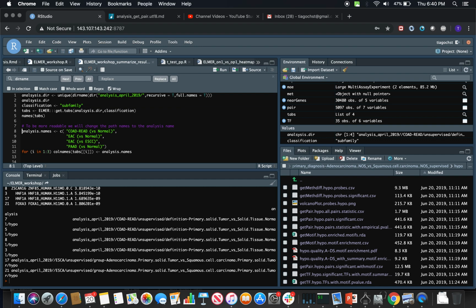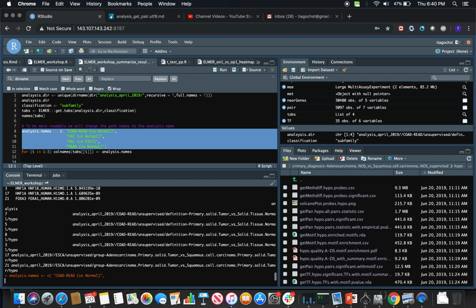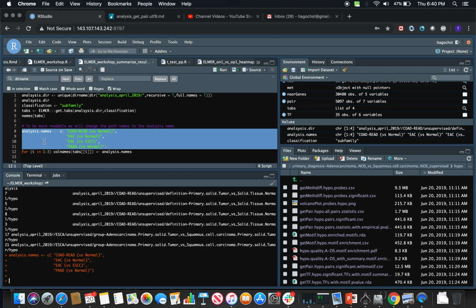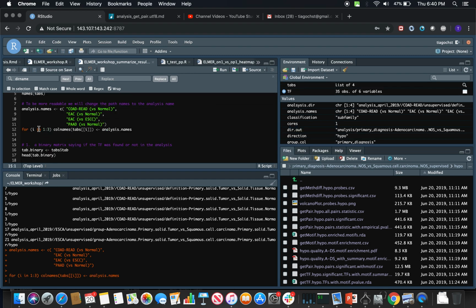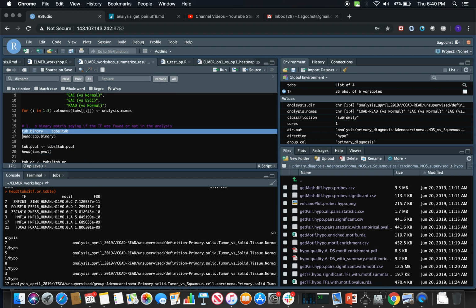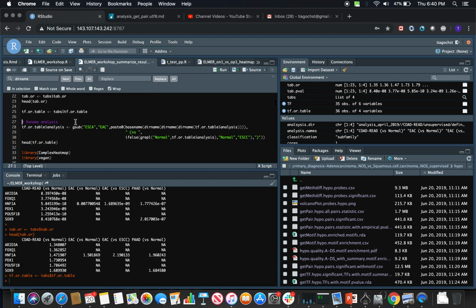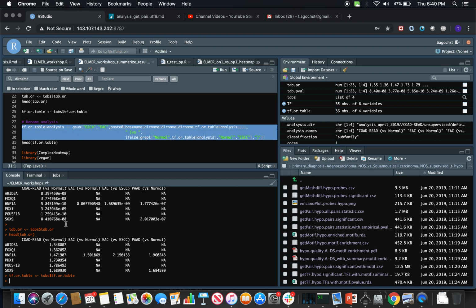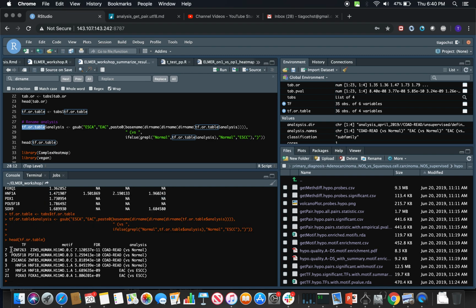So the first thing we do is actually renaming. Instead of having the path files as columns, we're going to rename them. Okay, so we use these functions. We use only the first 3 data tables because the last one, as we can see here, is not on the same format as the first ones. So then I get the tables. Instead of being a list, I rename the last table. So now we have the TF, the motif, the FDR, and in which analysis was identified instead of the path.